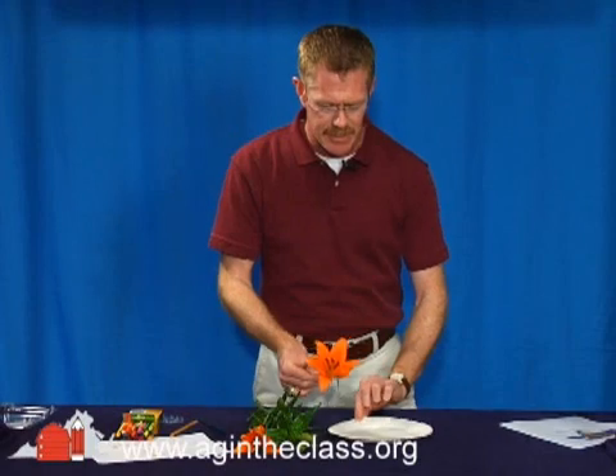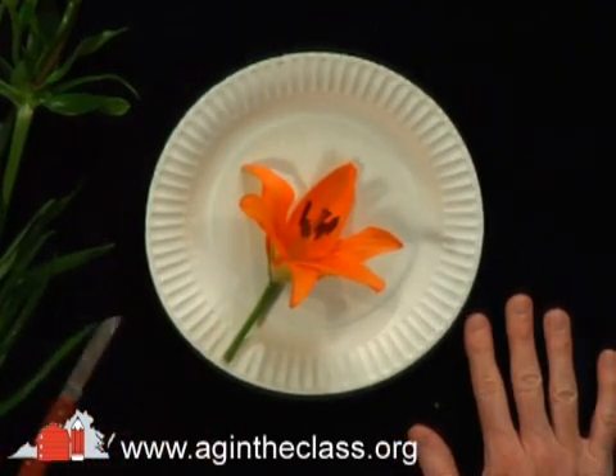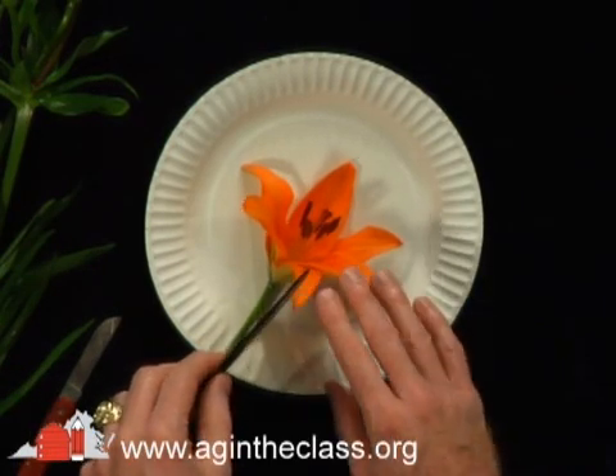Remove the lily from the main stem. I recommend putting them on a paper plate or some type of surface to actually cut. I'm going to use a sharp knife for demonstration purposes, but with your students, I recommend using a plastic knife so they don't cut their fingers, but it will still cut through the plant material because it's very soft.